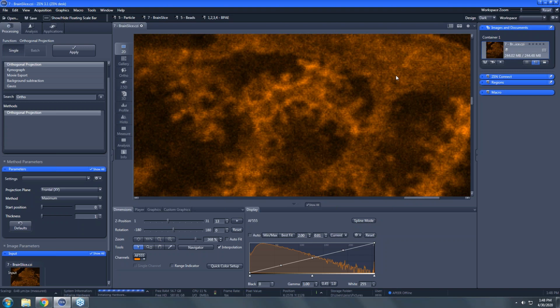So we're going to do some image processing to show you what you might do to make this a little prettier. And I'll mention that it's exactly that. We're making this pretty. So these are not quantitative techniques. Please don't apply these and then do some mean intensity measurements, because of course we're changing the intensities as we modify the image.